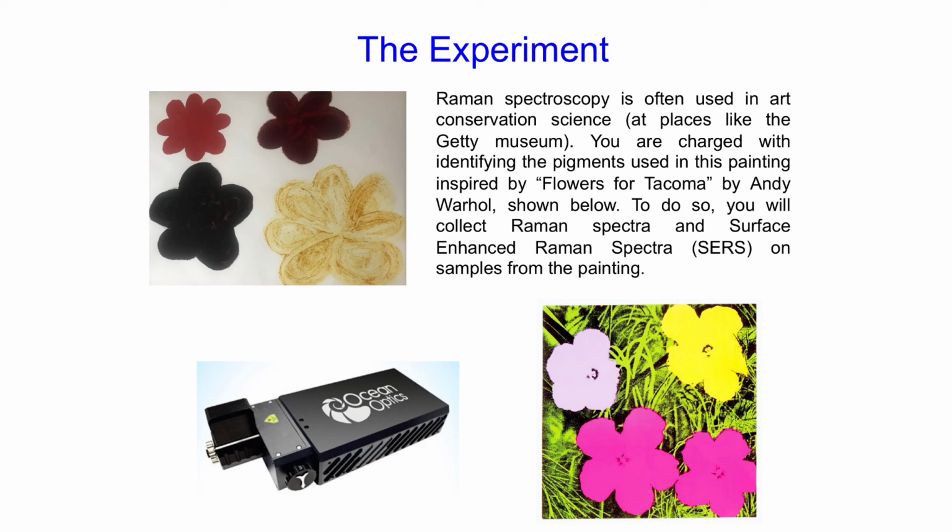SERS is detailed in your lab handout. We're not going to talk about that in detail here, so make sure you take a look at the handout to get your background on the SERS technique.